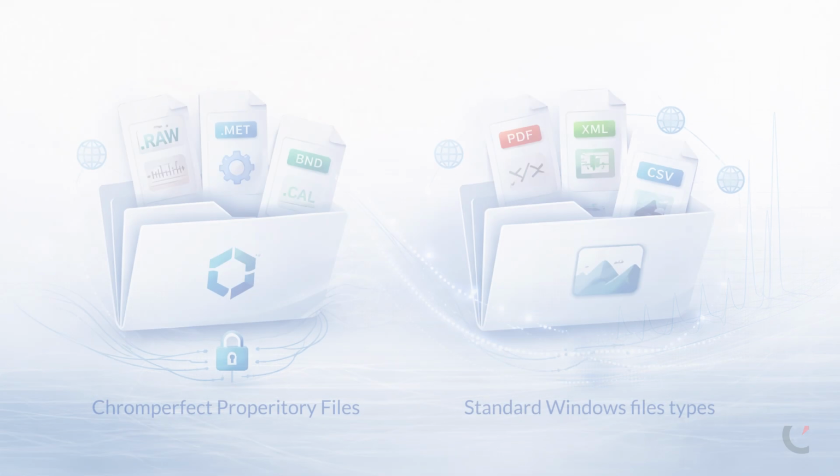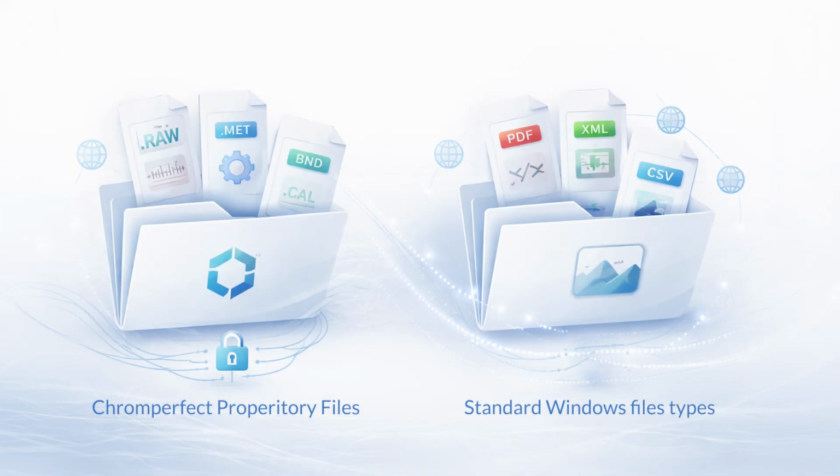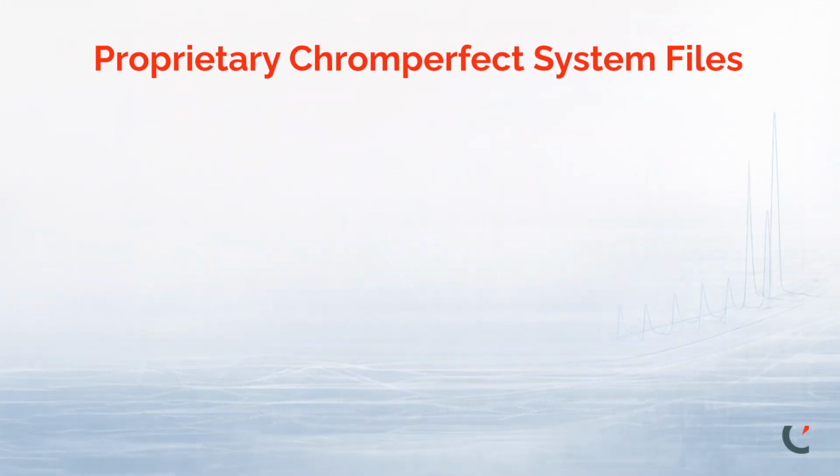We will discuss two categories of files: Chromperfect proprietary files, which are internal to the Chromperfect system and cannot be used within other platforms, and standard file types, which can be used to transfer data to and from Chromperfect and provide useful information to a wider audience and software ecosystem. Let us first look at the proprietary Chromperfect system files.